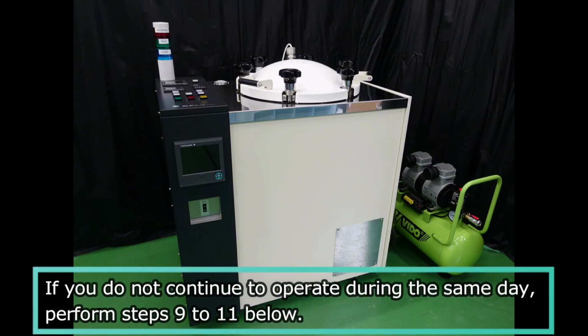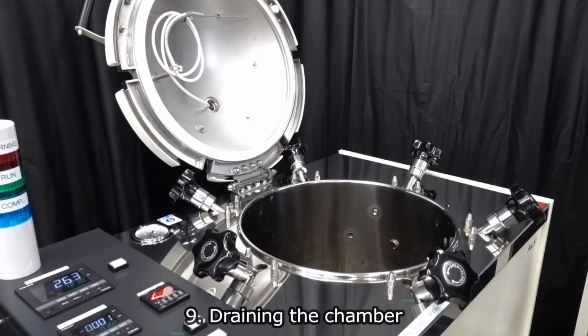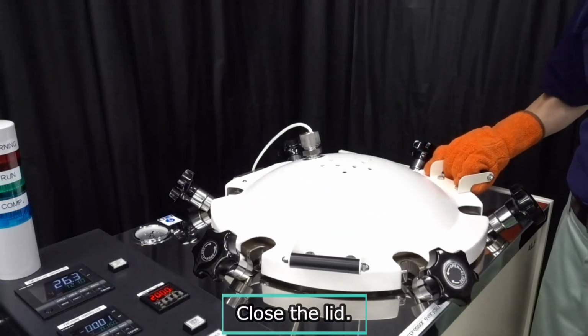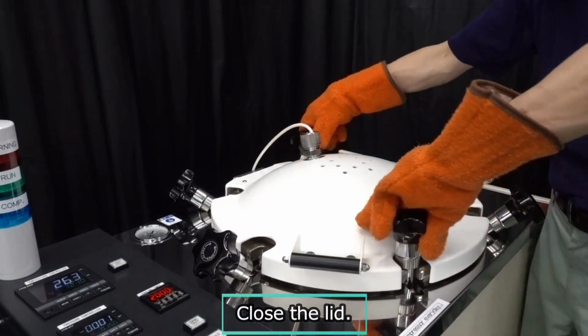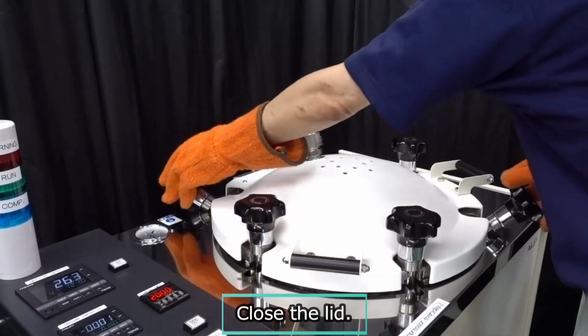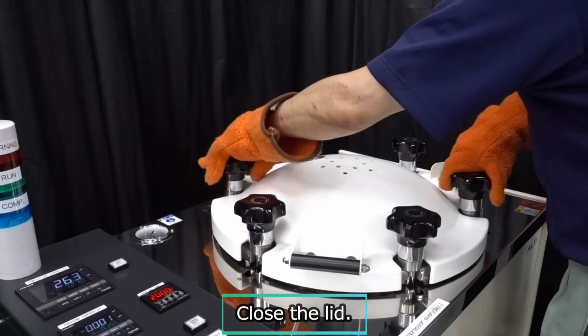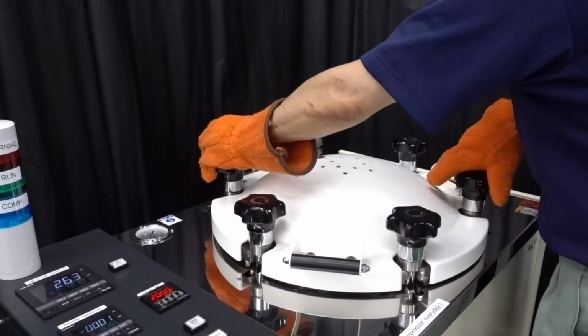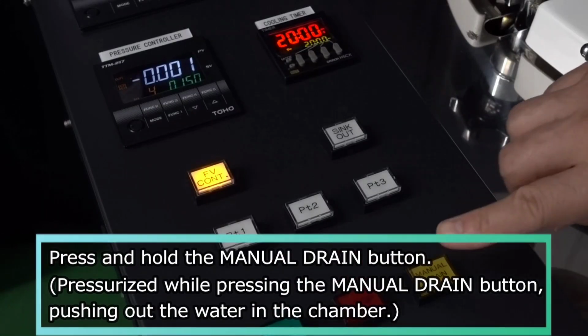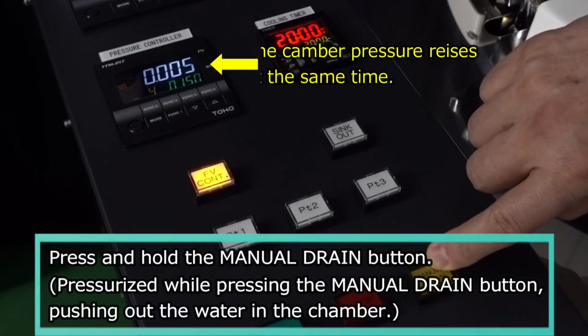If you do not continue to operate during the same day, perform steps 9 to 11 below. Draining the chamber. Close the lid. Press and hold the manual drain button.